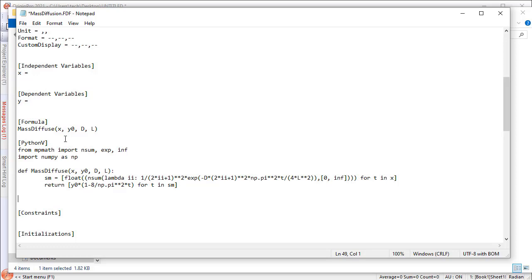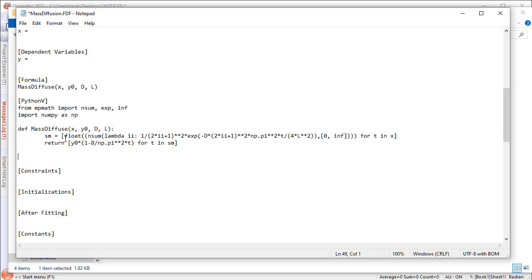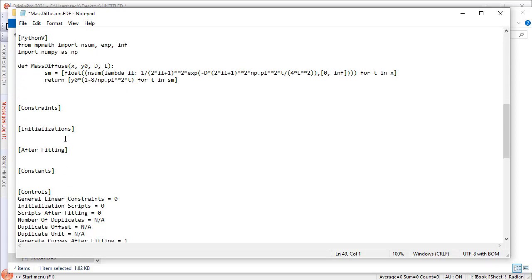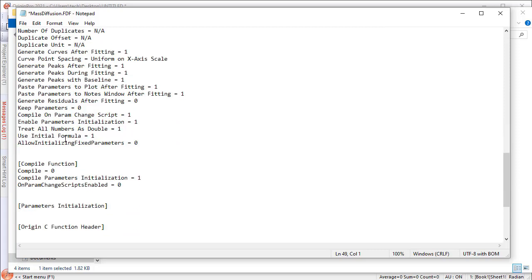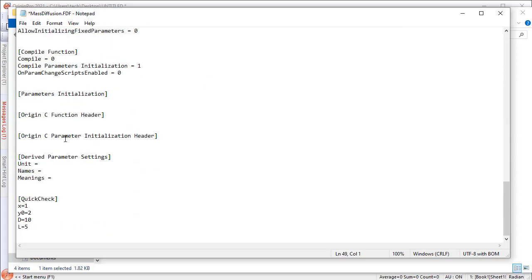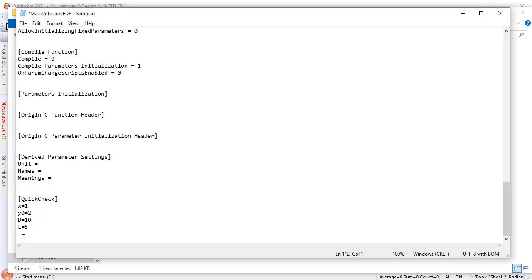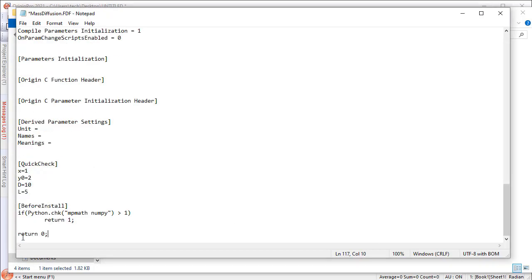This function requires the MP Math and NumPy packages to be installed prior to using the function. If you would like to share the fitting function with others and want these two packages to be auto-installed, you need to add a Before Install section.